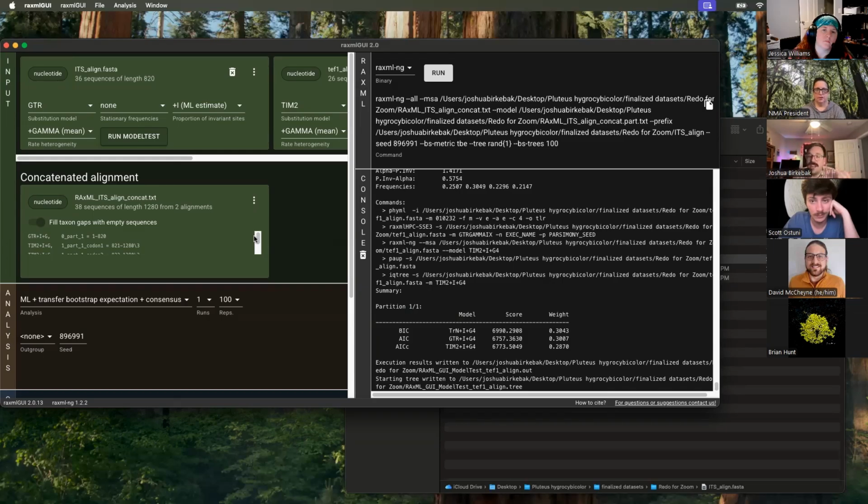It's probably not going to have a strong effect on your data unless you have something really conserved, like small subunit, where there are very few changes, or something really noisy, where you might need to fit a different type of model, or an oddball with weird directional evolution, where you have directed changes in transitions and transversions for very specific things. Most of the time, it's not going to matter too much. Go ahead and do it, since RAxML does it for you and makes it really easy.